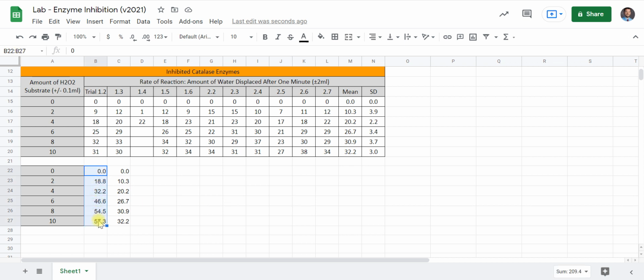We're going to take this entire column. I'm going to copy it, and we're actually going to take these and just move them on down like this. It's extremely frustrating to do this process. I am hitting Control X, that cuts it and lets me paste it as I move along. Now I know that looks really frustrating, but what it's doing essentially is keeping this in its own y-axis. I'll show you why in a minute. So we just did it for this one. Now we're going to need to do it for this one. You're going to need to copy this and paste it here. And just like before, we're going to need to put each data point in its own individual category.